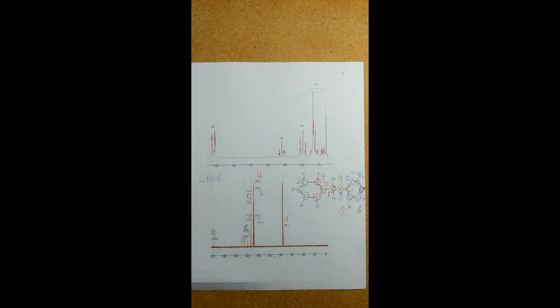Okay, again, due to the large nature of this structure, I've gone ahead and redrawn the same structure that was drawn in HNMR, and I have labeled the carbons this time instead of the protons in order of deshielding. The deshielding in CNMR works the same. Left is downfield, the most deshielded, and right is upfield, the least deshielded. So I'm going to walk you through why I did what I did.